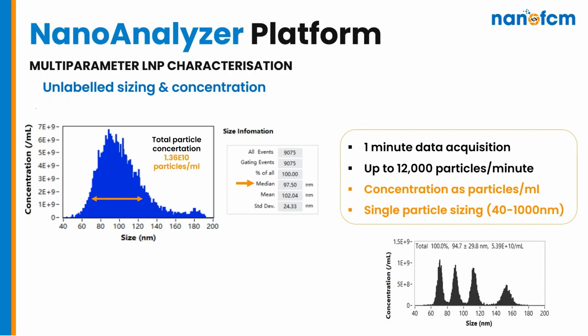And here they're mixed in even number concentration and detected in the same sample to produce the result we see in the lower right. The height intensity that produces each of those sizes and size peaks is then used to create a calibration curve that results in our blue trace for our sample where its median size is detected.